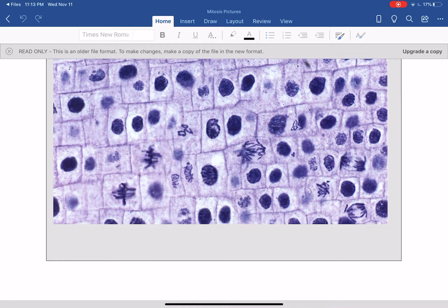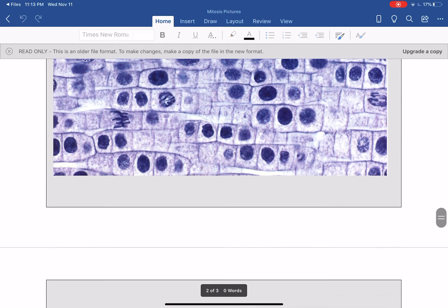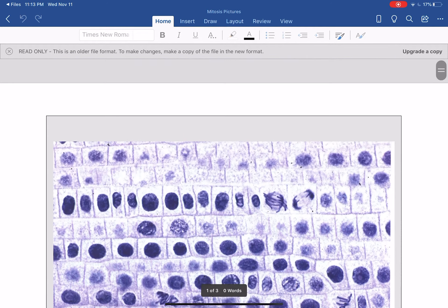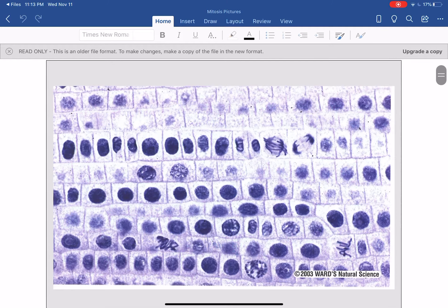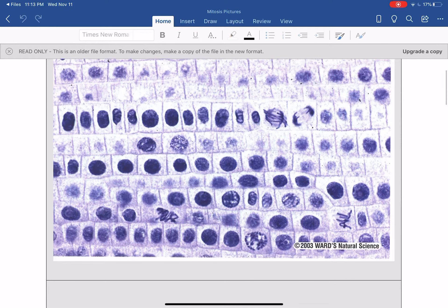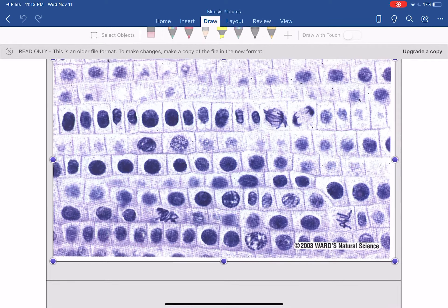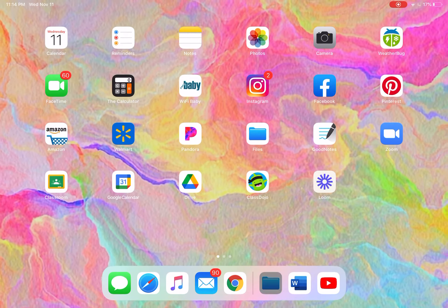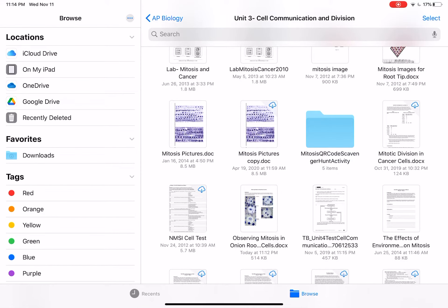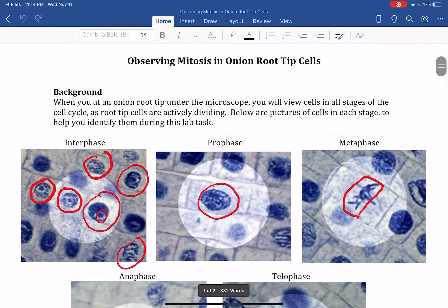If you go over to 104, that's fine, it doesn't matter. You just need to get 100 at least. So if you have somebody there at home that can tally while you count, that's going to make it a lot easier. You can just sit there and say interphase, interphase, interphase, and somebody can tally while you say those as you go down the row and read them. That's going to help you out a lot. If you don't have that, then you'll just kind of have to tally for yourself, but you've got to count 100 of them.